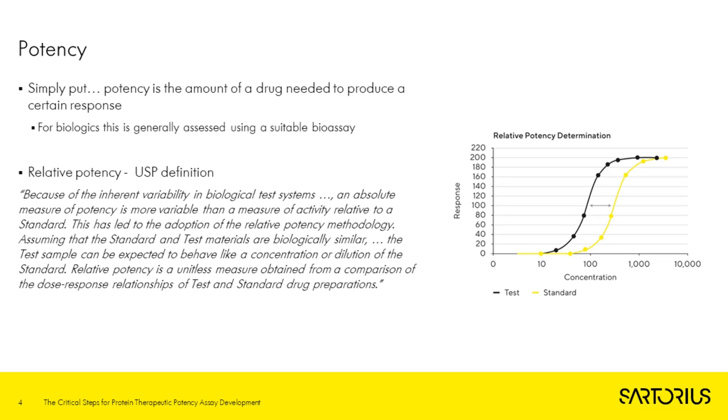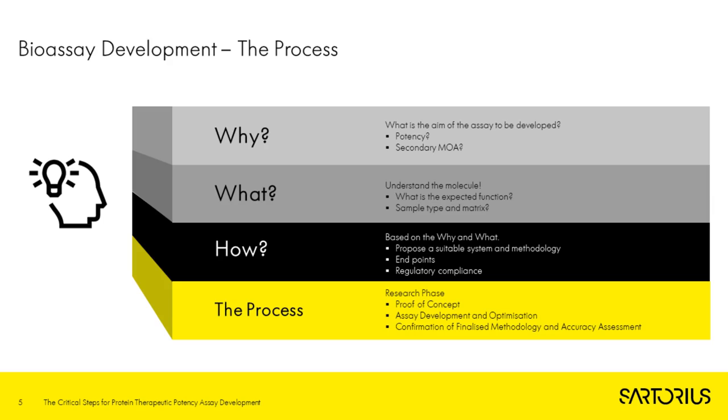So for this to be valid, the standard and the test material must be biologically similar, such that the test sample ultimately behaves like a dilution of the standard. And we have to meet several important statistical criteria in order to generate a valid relative potency result. However, that's not going to be the focus of the talk today.